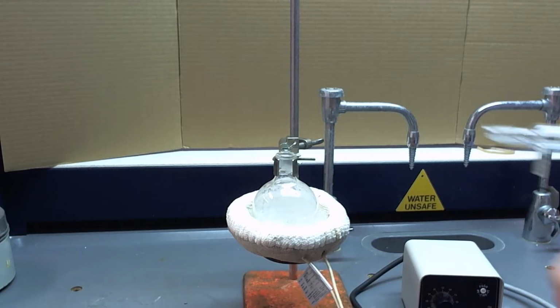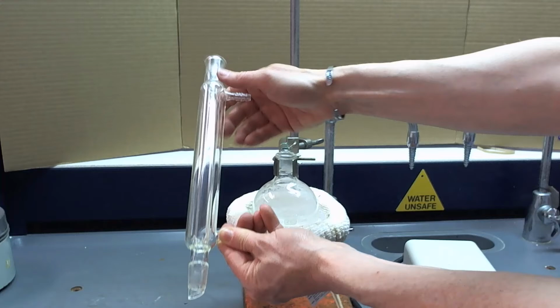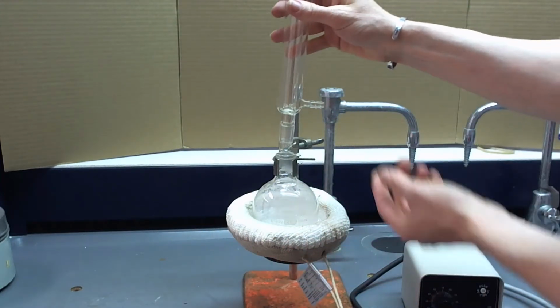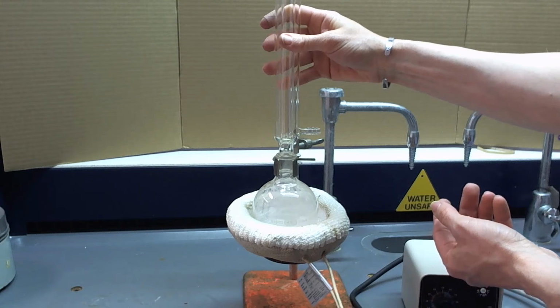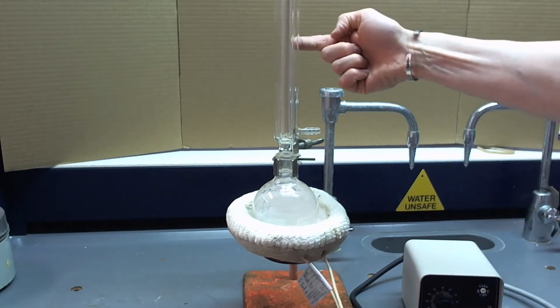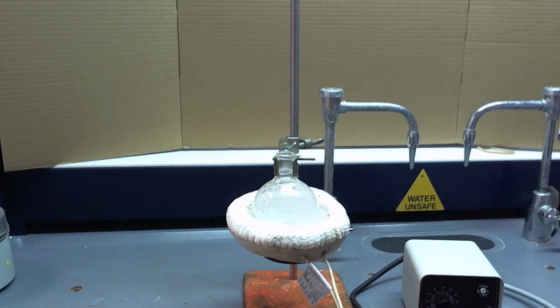You need a piece of glass called a reflux condenser. Okay. You should have a couple of these in your drawer. There's a ground glass joint. It should fit perfectly in your flask, like so. Okay. You don't need to clamp this if the flask is clamped firmly at the neck.